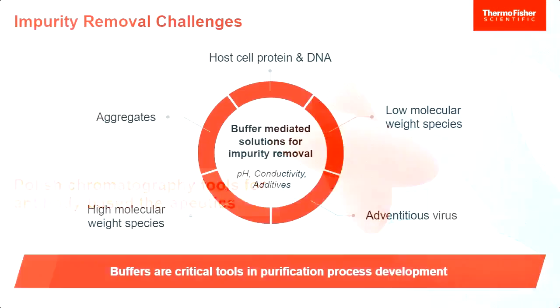Thank you. As we progress through purification, one of the biggest challenges is removing impurities while preserving product quality and yield. Buffers play a central role in addressing this challenge, whether it's host cell proteins, DNA, aggregates, viruses, or low and high molecular weight species.